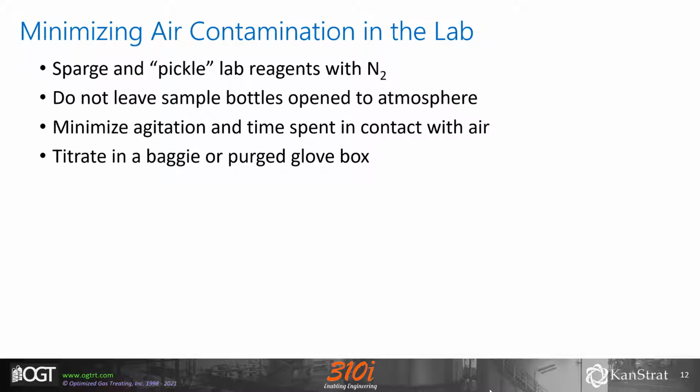Minimizing air contamination does not only apply to catching the sample, but care also needs to be taken when handling the sample for testing in the lab. We've shown some techniques here to do this of varying complexity. A lot of labs don't like dealing with H2S bearing samples. However, you can do these tests in a purged hood or glove box. The basic idea here is to minimize contact with air using a number of ways.